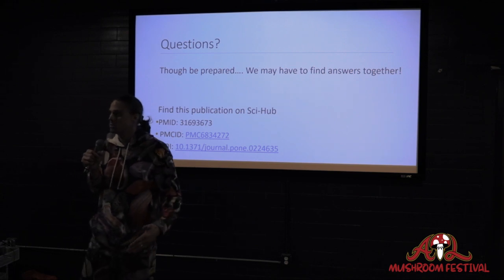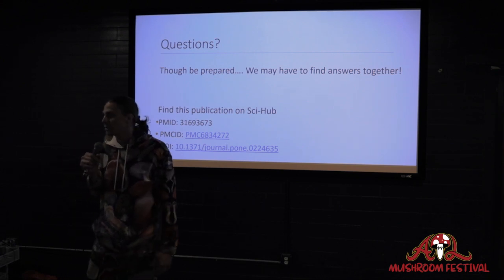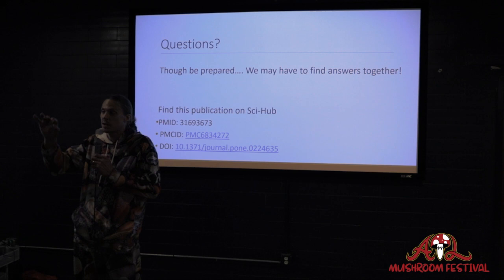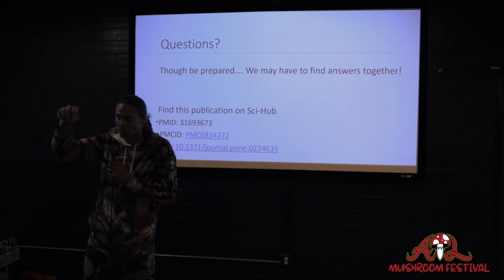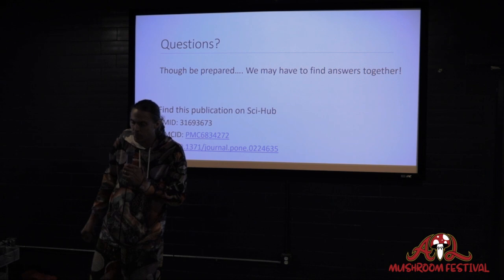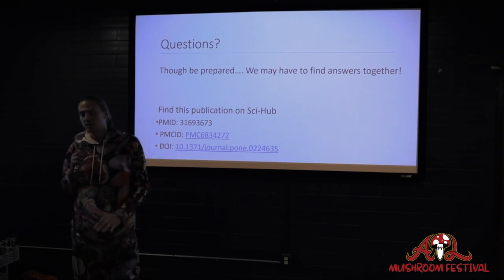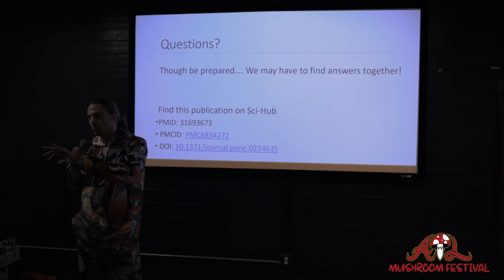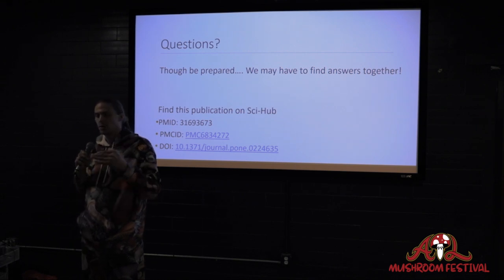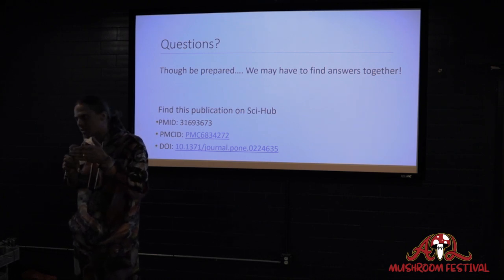But I will sometimes also isolate samples from the very top of the roof itself. So I go for what looks good. If I like the way the roof looks, then I'll select from the roof, but making sure that I do not penetrate into the cabin. I will just go just a millimeter deep or less, just to scrape off the mycelia on the top and put that on another plate. Or if I like what's growing on the edges of the cabin, then I will select from the edges, but I try not to select too close to the edges of the cabin roof. I'll try and go like a couple millimeters at the closest away, just in case there might have been some contaminant that was smeared around. And if you're selecting just from that edge, there might still be something there.